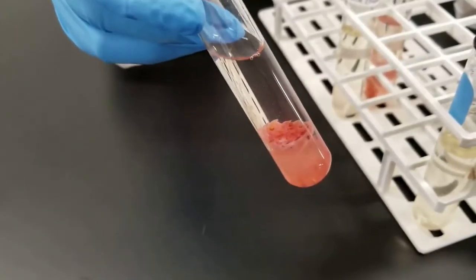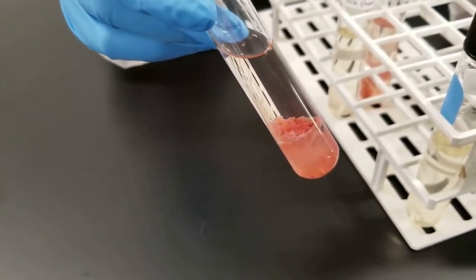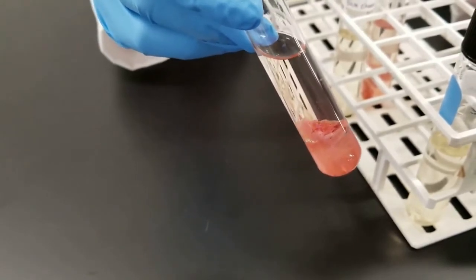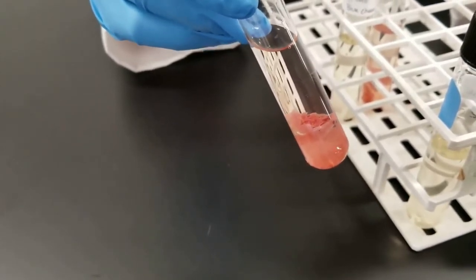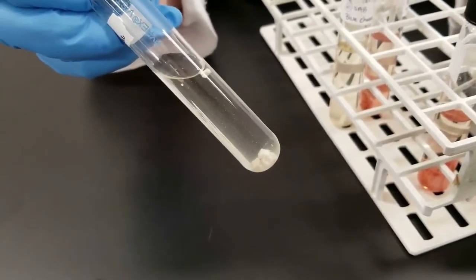So once again, the strawberries, you can see, has extensive growth on the surface, but the media itself is clear. That's one way you can always distinguish, oh, do I have fungi growing in there, or is it bacterial? Look to see whether the liquid portion is clear or is it cloudy? And then the blue cheese at room temperature, you do have some growth starting there as well.